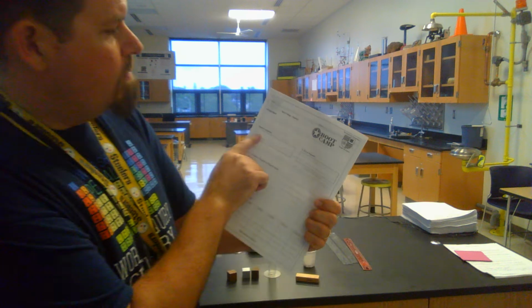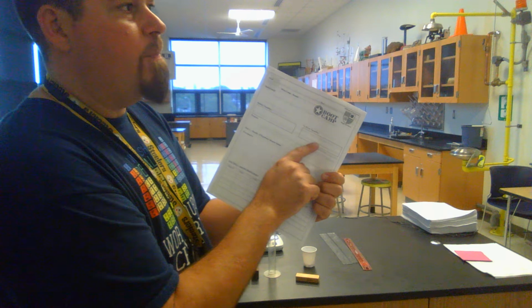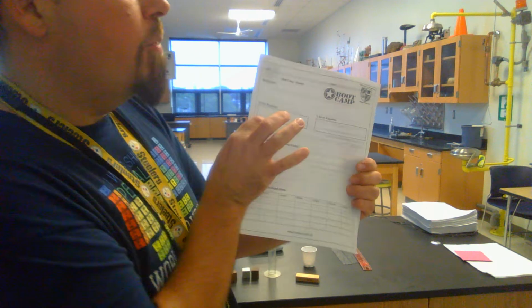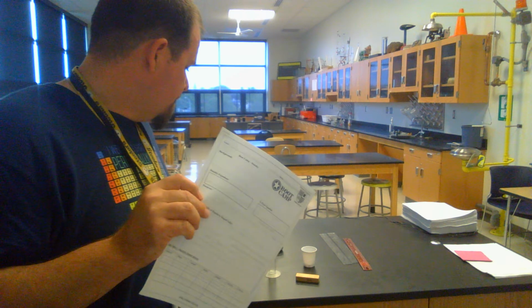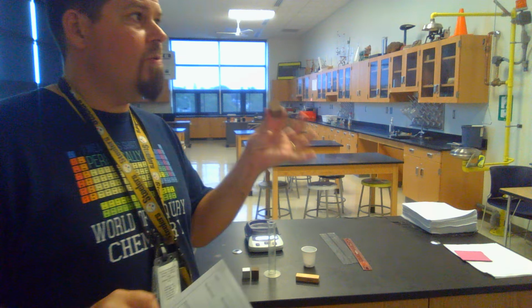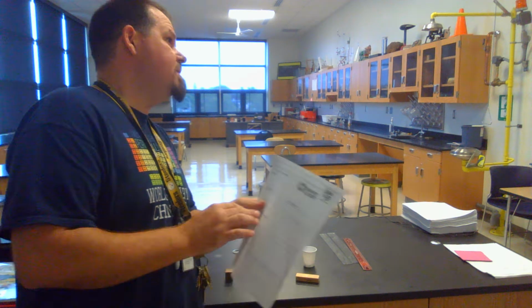Okay. Put in the equation for density, and you need the equation for percent error. Okay. And you can look those right up. Purpose of the lab. Purpose of this lab is to use density to identify an unknown metal. I would say that is the purpose.